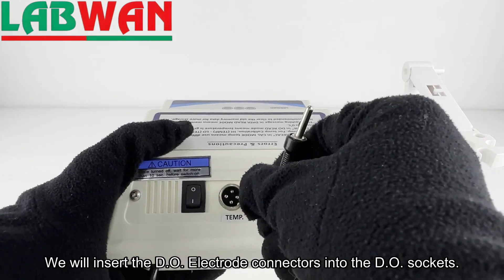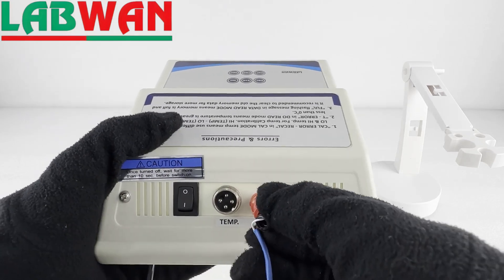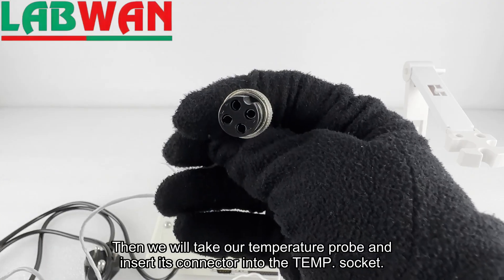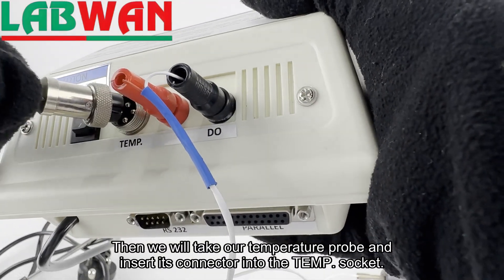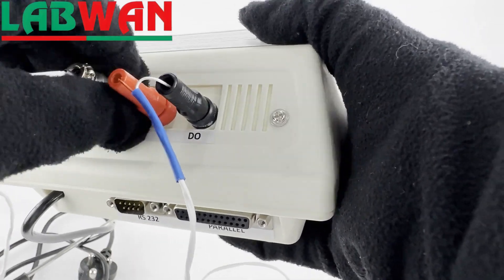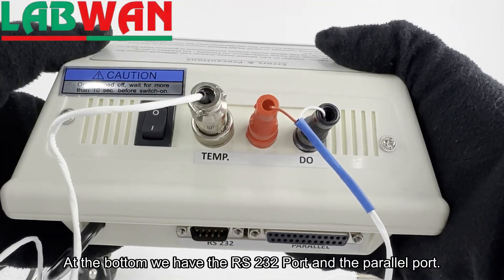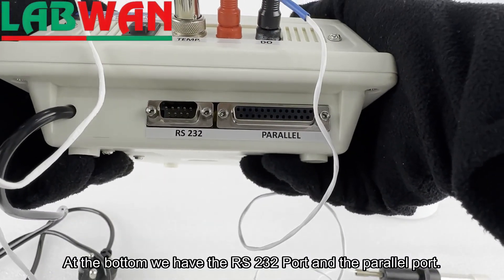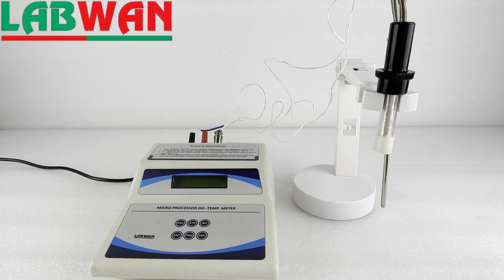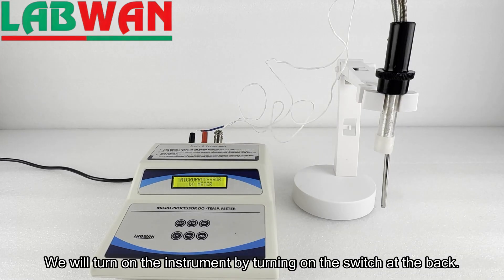We will insert the DO electrode connectors into the DO sockets. Then we will take our temperature probe and insert its connector into the temp socket. At the bottom we have the RS-232 port and the parallel port. We will turn on the instrument by turning on the switch at the back.